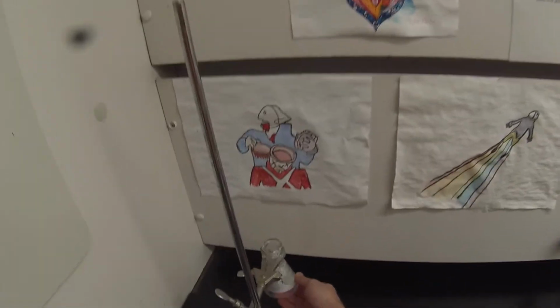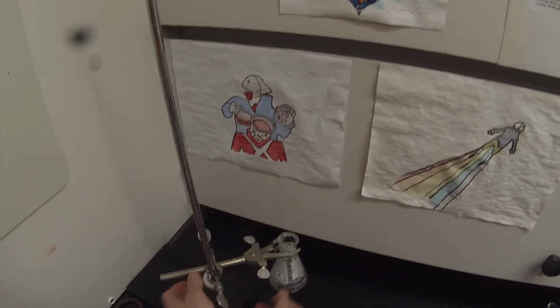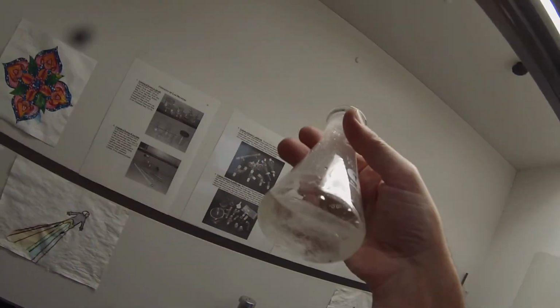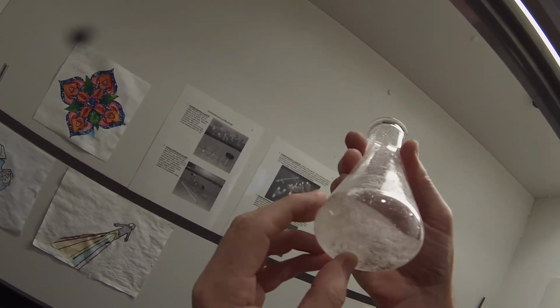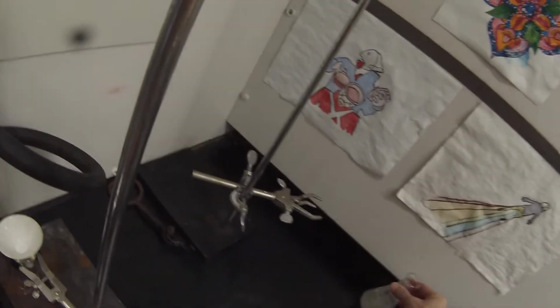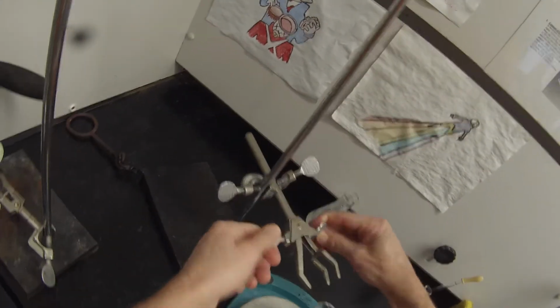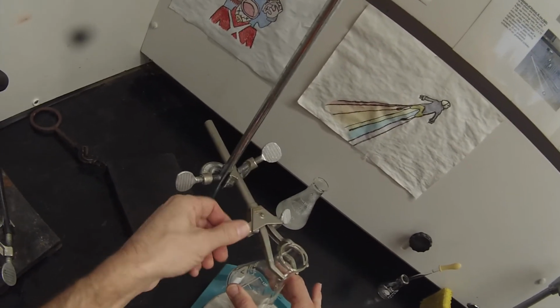This is probably cool enough now that I can disconnect it from its moorings. You can see that we're starting to get some nice needles, right? Some fairly long crystals. The slower it cools, the nicer the crystals and the less likely we are to trap impurities. So I want to let that cool nice and slowly. Let's stick that in the back, and that way I can use this guy to clamp the new Erlenmeyer flask so it doesn't walk its way off the stir plate.